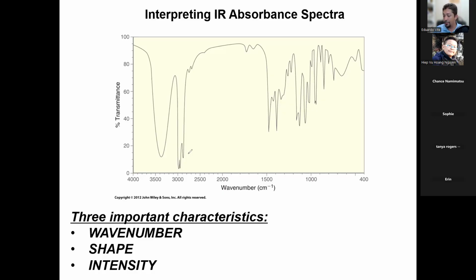All right. And like I mentioned, if you don't know your functional groups yet, you've got to catch up, because if you don't know what the functional groups are, you can't even answer the questions here. You need to know your functional groups by name. You need to know the compound functional groups, meaning like a carboxylic acid, because you're going to see multiple peaks and you have to be able to put together the information, right? Okay, here we go.